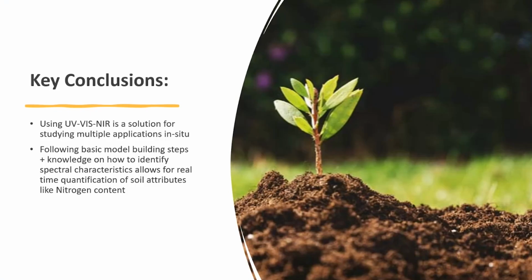Ultimately, these spectroscopy and chemometric approaches make soil monitoring faster, more accessible, and more scalable for large targets like farms or soil fields or forests. And environmental managers with this data can make better and more sustainable decisions in the future.